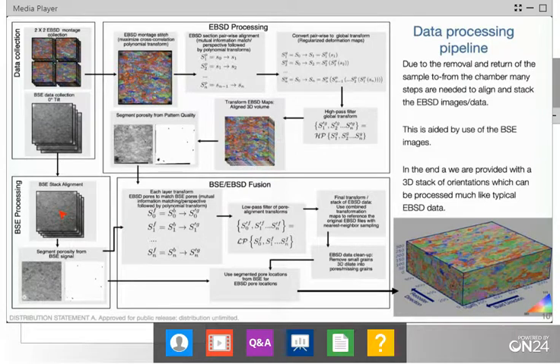If you look and stare long enough as a human, your pattern recognition engine will recognize certain similarities, but it's very difficult to get that to line up with the EBSD maps. Now, on the side of the EBSD maps, what we did is we first stitched all these maps together. We have an algorithm that will stitch these together and give us a fairly seamless set of data. And then we did pairwise matching of all of the sections.